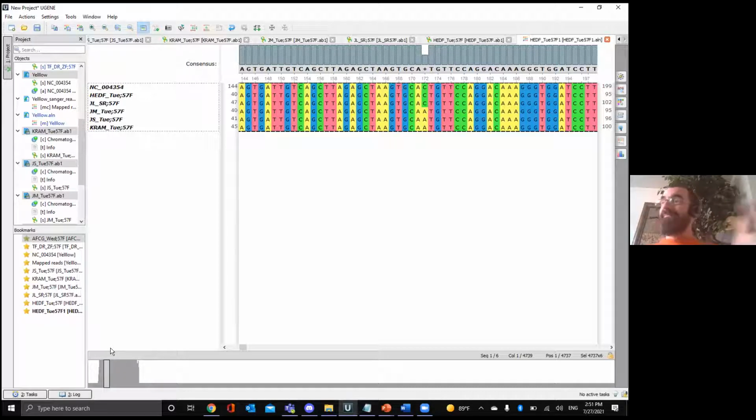Okay. Ta-da! Awesome. So yeah, the last time it didn't work, that was my fault. Sorry about that. So yeah, once you've done the alignment, don't touch it. Okay. That's the lesson there.